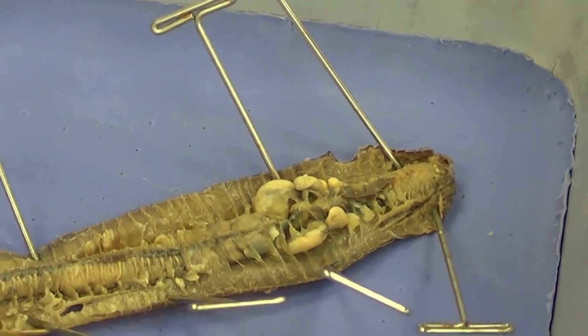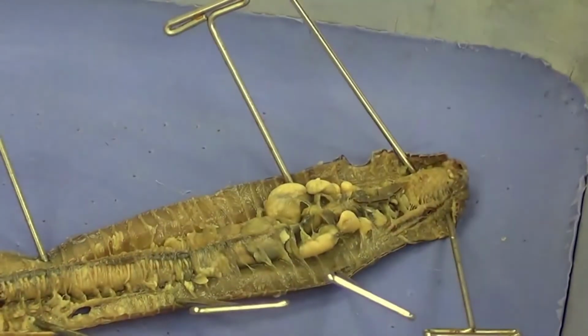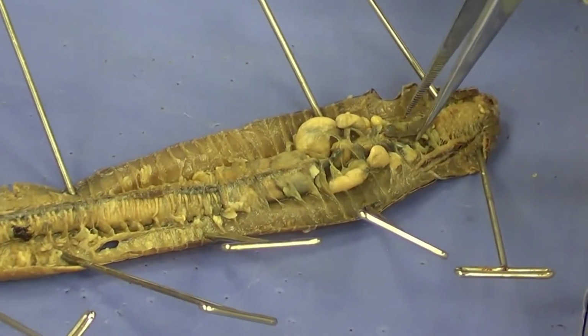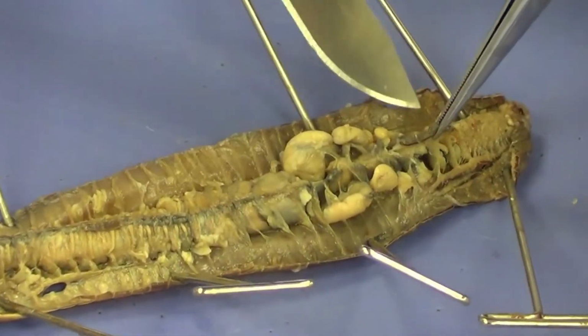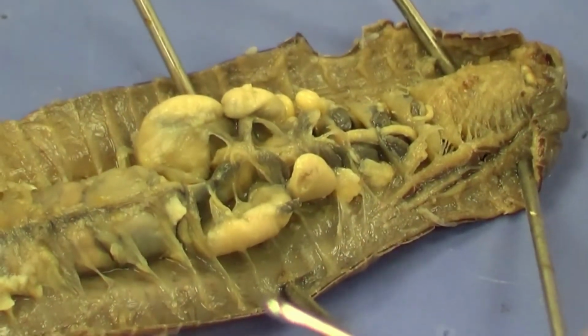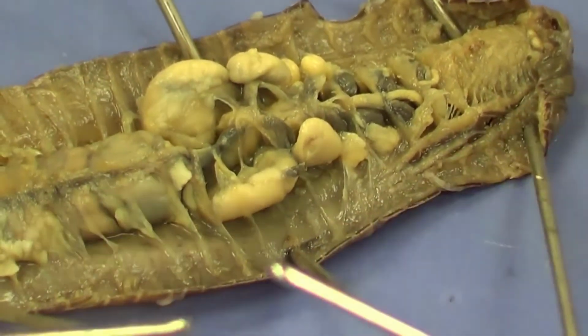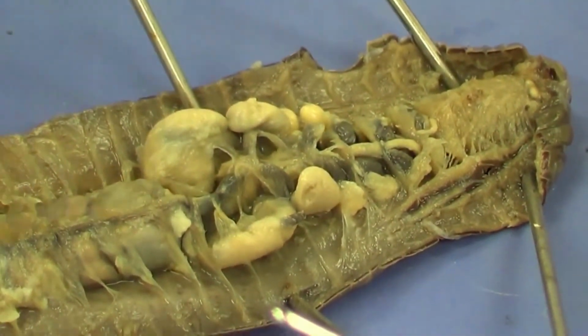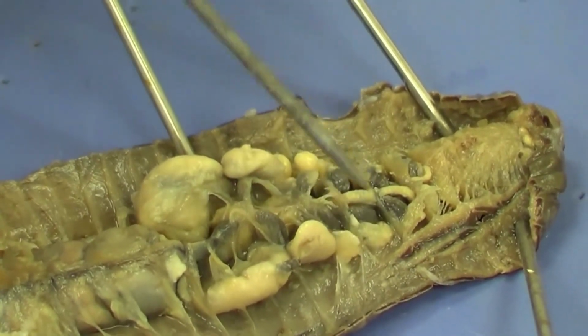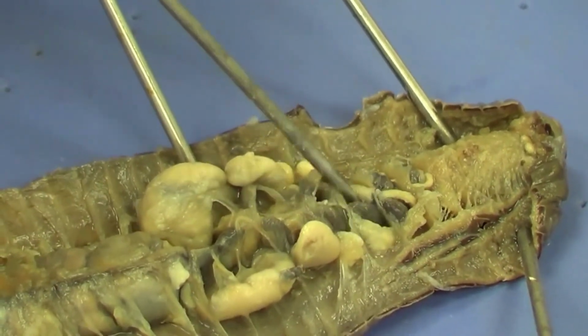Now, what we can do here, I see a little bit of skin still left on here. I'm going to pull it up just a little bit and cut that skin away very carefully. There's some good structures there, and we don't want to injure those structures. And what I'm looking for now, after I move the seminal vesicles and the seminal receptacles out of the way, is I'm looking for those aortic arches or hearts.